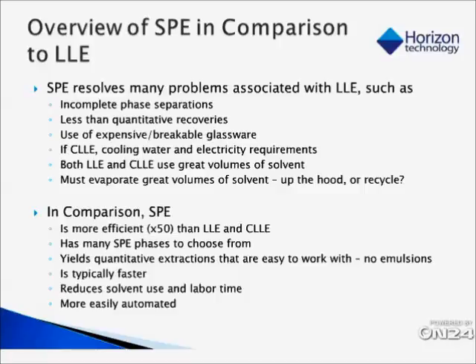It yields quantitative extractions and, most importantly, no emulsions, which you can find happen when you do a liquid-liquid extraction. Reduces solvent use and labor time and it's more easily automated. And I think this is a key factor, and we'll talk about that going forward.